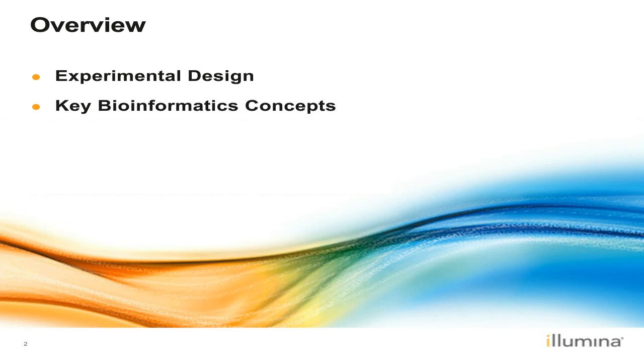So we are going to talk about different methods for data analysis and how they apply to specific workflows and how they can be used for your particular experiments. And then the last portion, we're going to be talking about Illumina data analysis solutions. So we'll make sure to cover all of our solution suites, both on instrument, on cloud, etc.